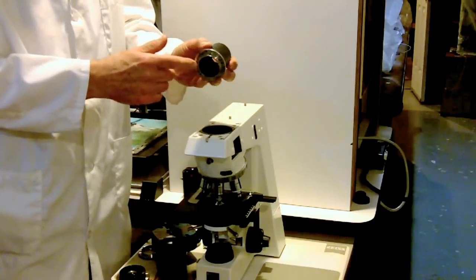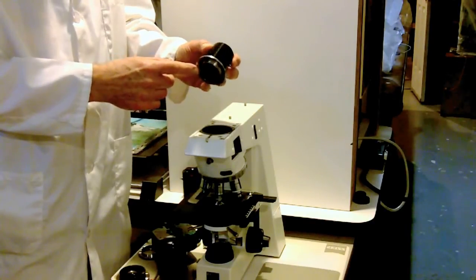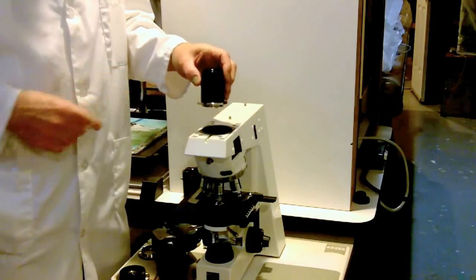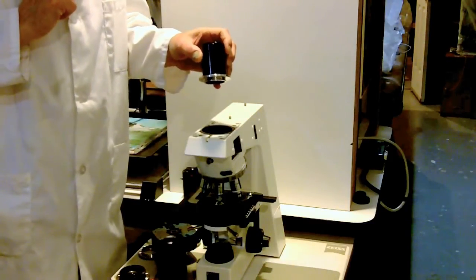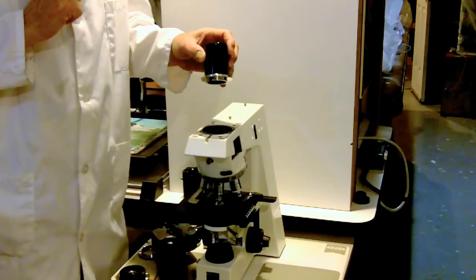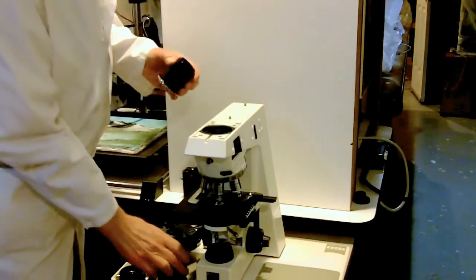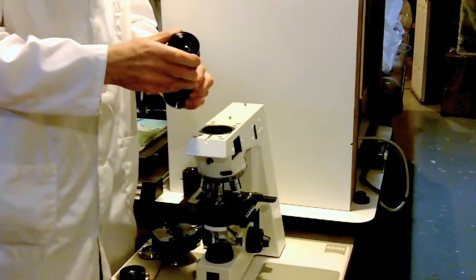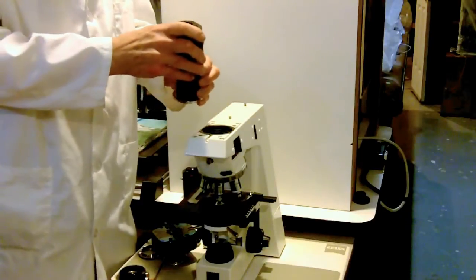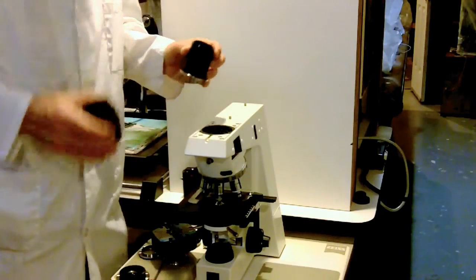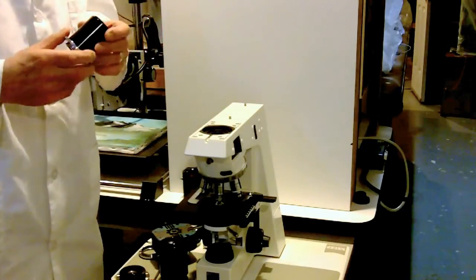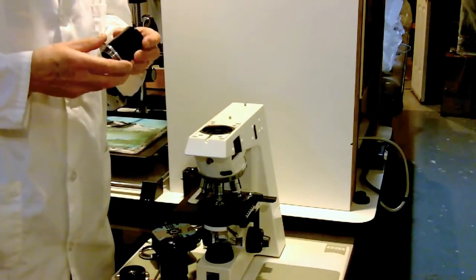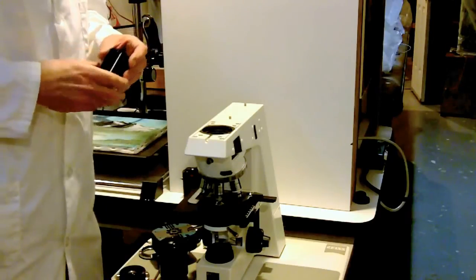Now we also have adapters with a long tube on them that has a bayonet flange again for the various makes of microscopes that can be put on a really old microscope that's set up for finite tube length optics. This goes on and then we can put the InFocus on top of that, simply screws on, and then we can use any of the modern objectives, infinity corrected type, with an old 160 tube length microscope.